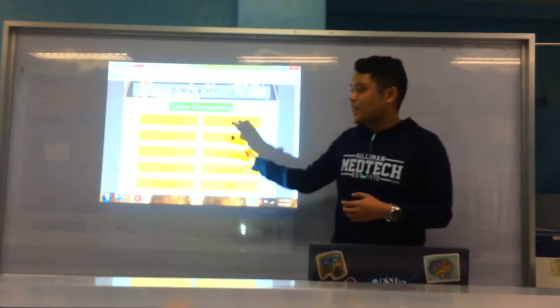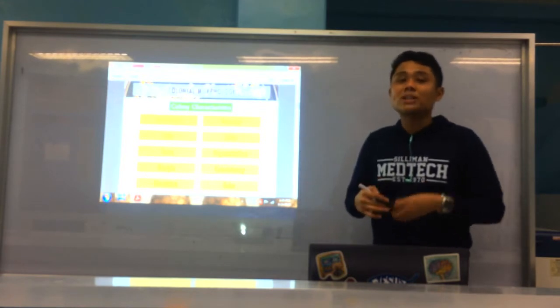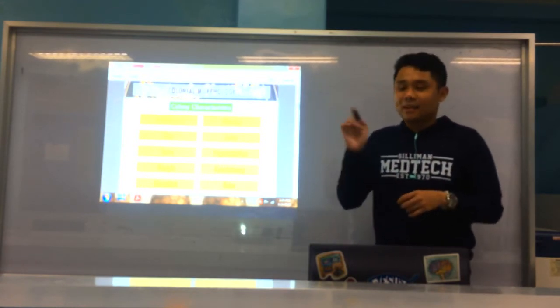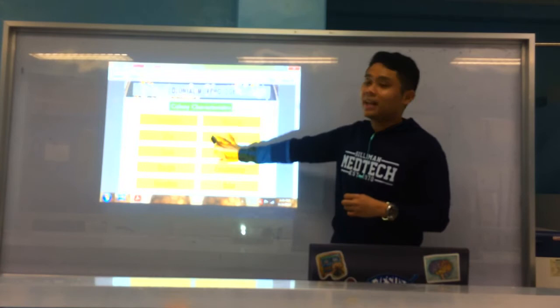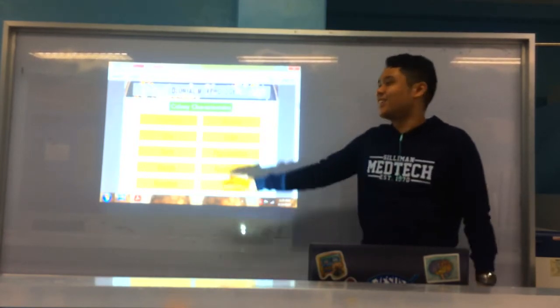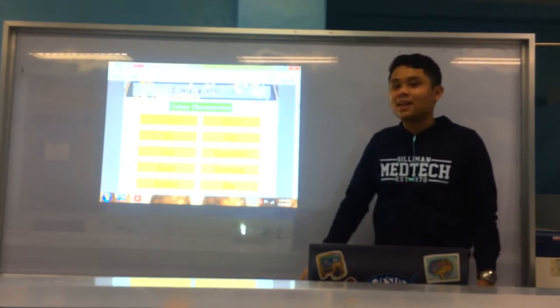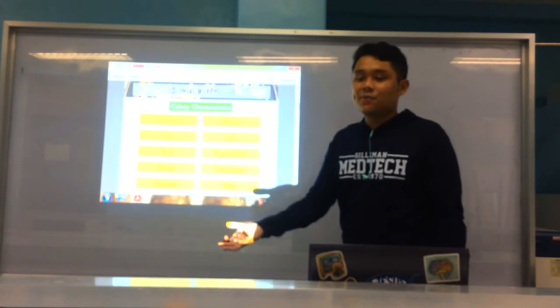Again, that could give you an initial identification, initial information as to the possible identity of your organism. But again, emphasize, we are not certain here. Okay? We're not like the others who give up right away. Joke! Okay, so moving further, after colonial morphology, we usually proceed to biochemical testing or other tests to really identify the microbe.